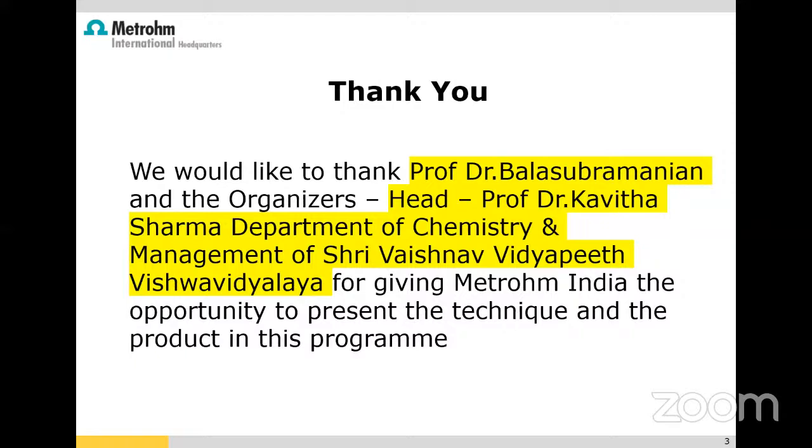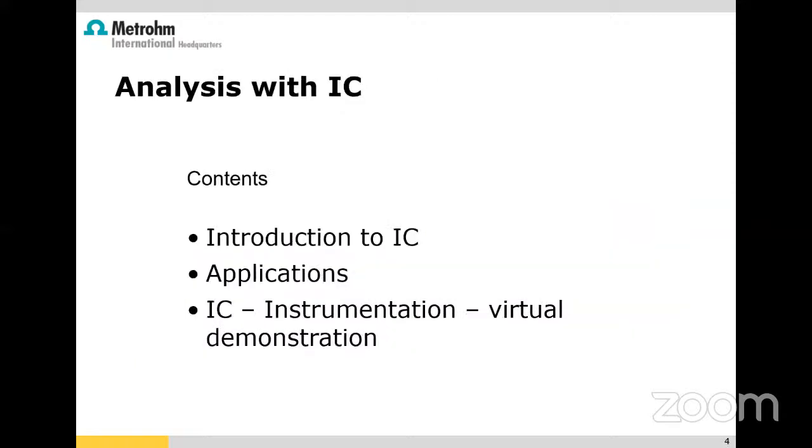And the session will go on like this. First, we will talk about ion chromatography. I will give you a brief on the theory. Then we will see a lot of applications. Then we will see instrumentation through a virtual demonstration. We have our own application lab at our head office in Chennai, and we have a very good studio setup where we can show our instrument through a virtual medium, like what you are witnessing now. Then we have one more technique, which is called voltammetry. First we will complete the IC presentation, then a virtual demonstration, and then again proceed to the voltammetry presentation and then followed by a virtual demonstration.